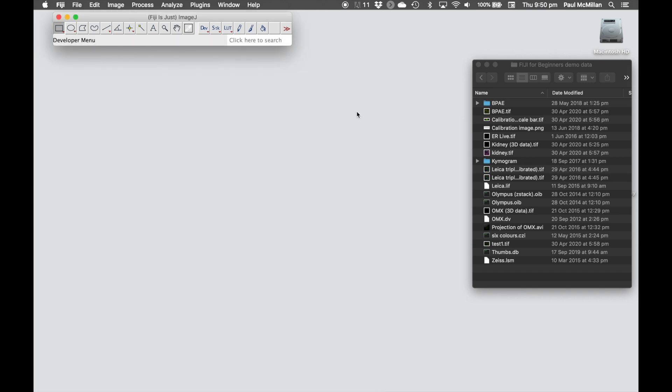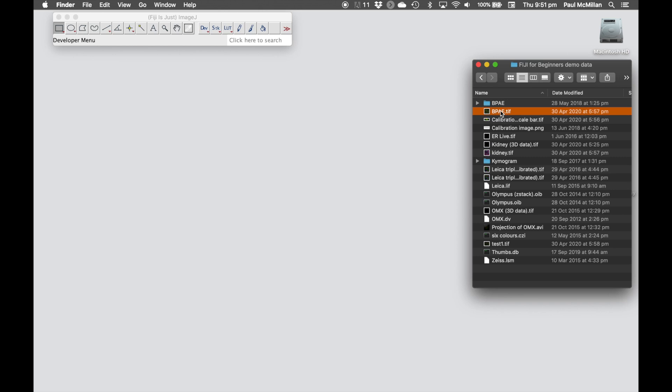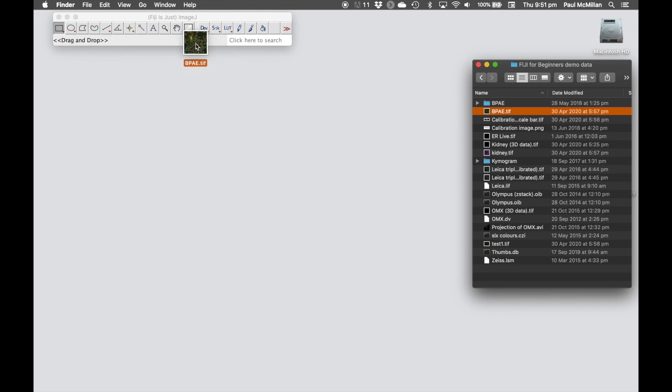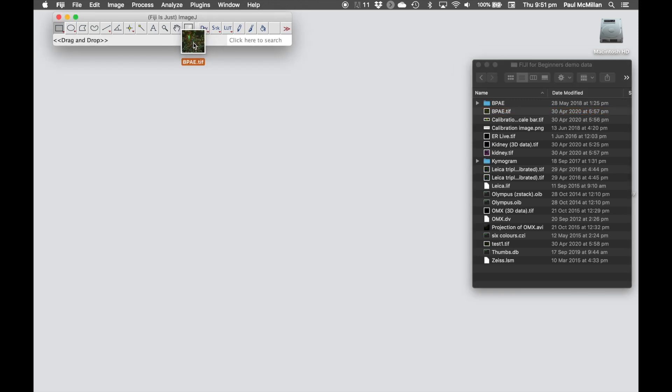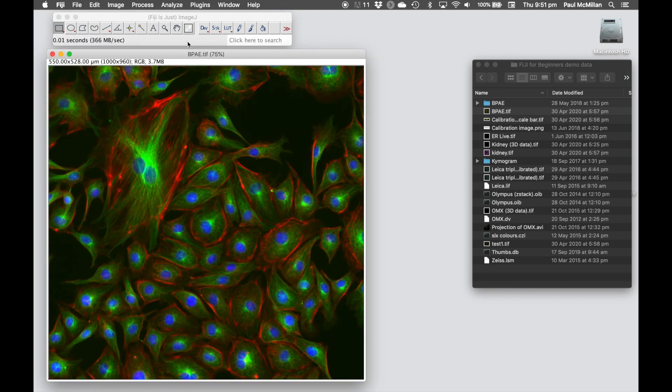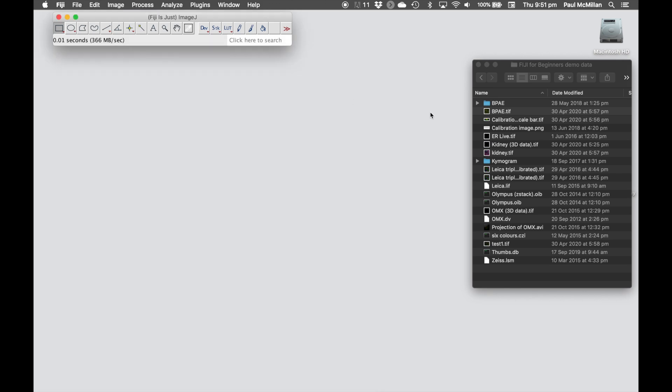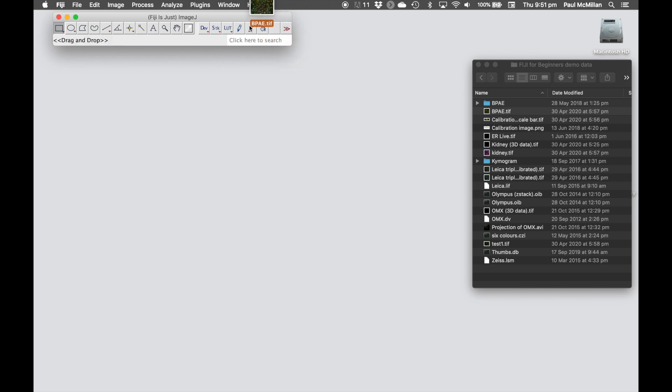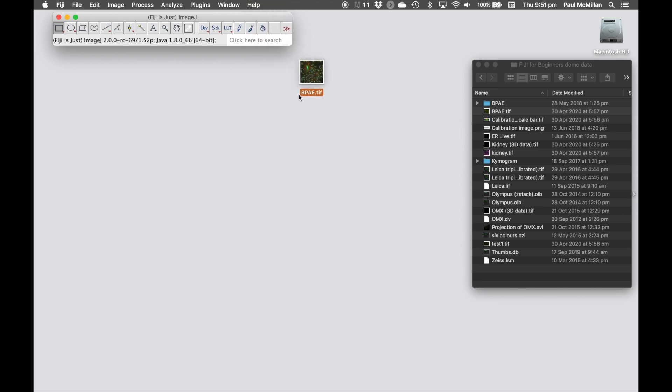I hardly ever use that. Mostly I use the drag and drop version. Here's that same file. If I left-click and hold, drag that across onto this bottom area, you can see on the left-hand side it says drag and drop. I now release, that will open up the file. What you want to avoid is dragging and dropping onto the desktop or anywhere where it doesn't say drag and drop. That just means you'll copy that file onto the desktop.